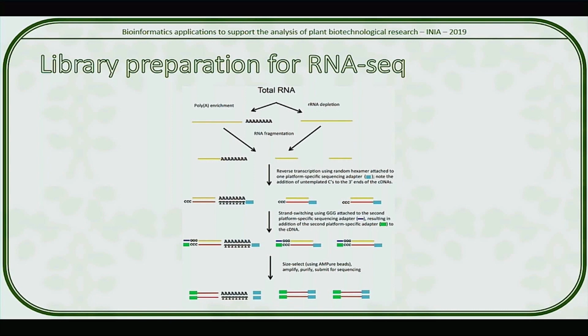This is part of the error that is going to be attached to my RNA-seq data: the fact that I try to isolate this tissue as much as possible, but there is always a physical limit. Nowadays, we were talking a couple of days ago with some of you, there are single-cell RNA-seq experiments, where RNA extracted from one single cell can be tagged and followed through the sequencing process until, once you get the sequence, you know which sequences belong to one cell only.